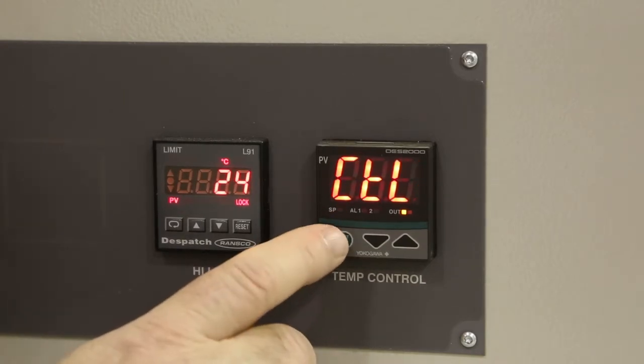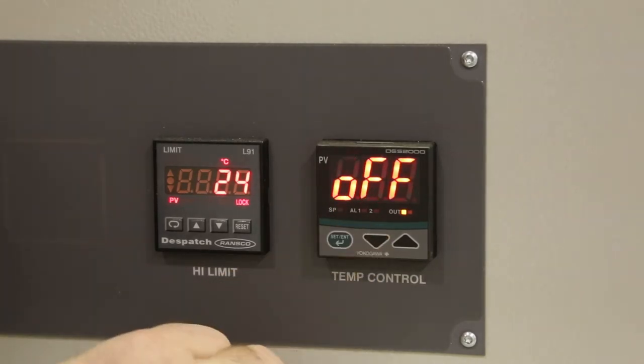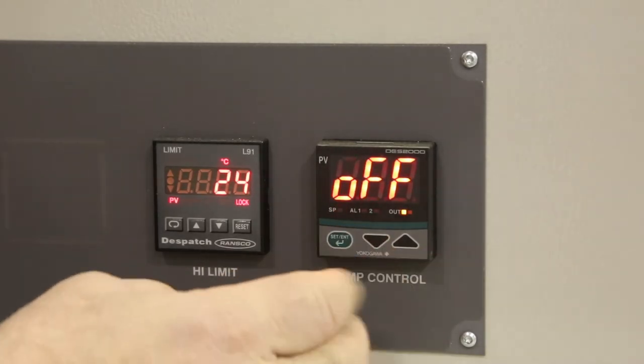Cycle the green button until AT is displayed, then press the down arrow. AT is for auto-tuning and it should be off.